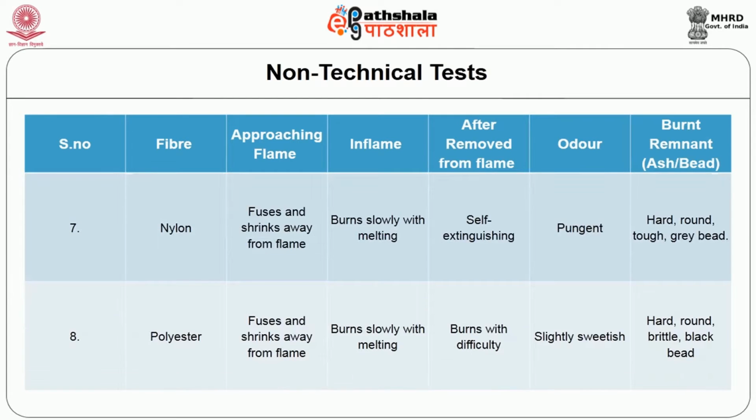Regarding synthetic fibers, under the man-made fibers category, nylon fuses and shrinks away from the flame while approaching the flame. It burns slowly with melting in the flame. While removing from the flame, it is self-extinguishing. The smell is pungent. The bead is a hard, round, tough grey bead.